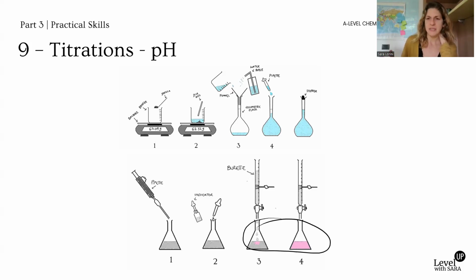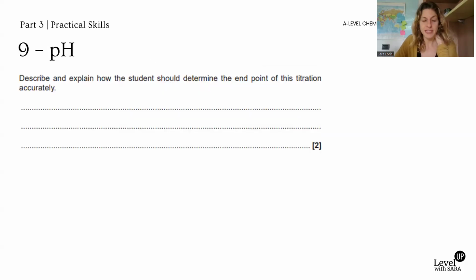Okay, so experimentally speaking, I think it's the easier part. The trickier ones are discussing values that you get from the titration. I'll show you a question very soon. And the other one would be the more technical part of titration curves, which is indicators. So let me show you. Let me read this question for a moment.